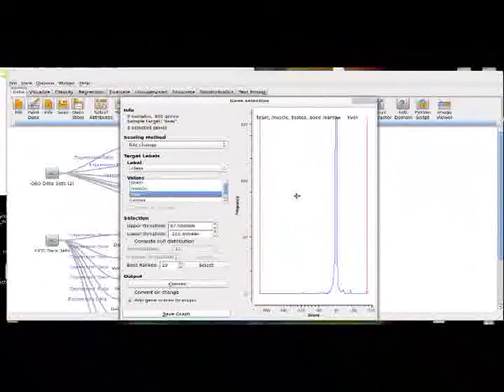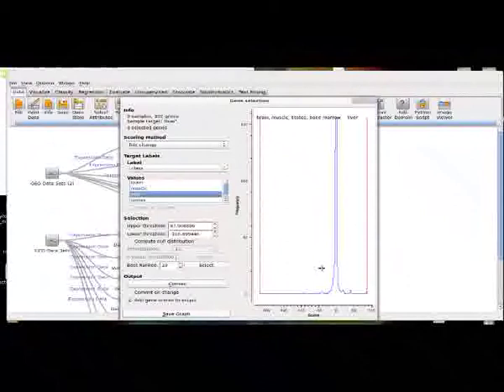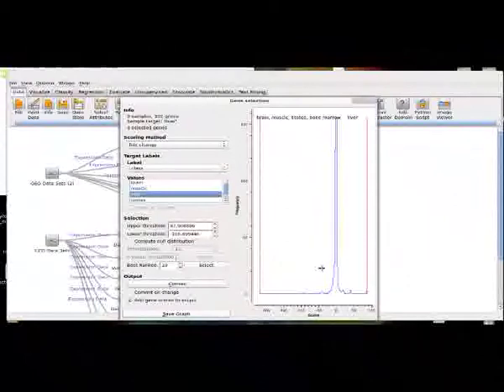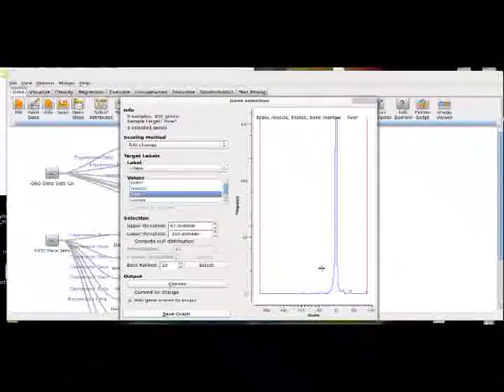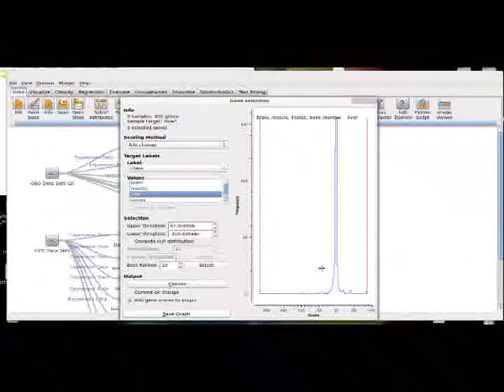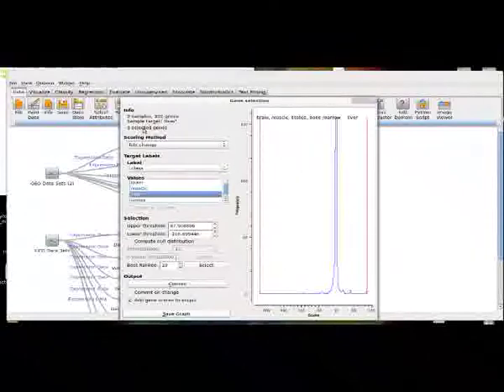But what's going on here? What do these selected genes mean? We didn't actually select any genes, and this data set is actually looking at 392 genes. So why is this widget selecting three? Well, I'm not exactly sure how the statistics of this works out, although I know that these are different kind of scoring functions for evaluating the statistical significance of something in relation to its classifier.